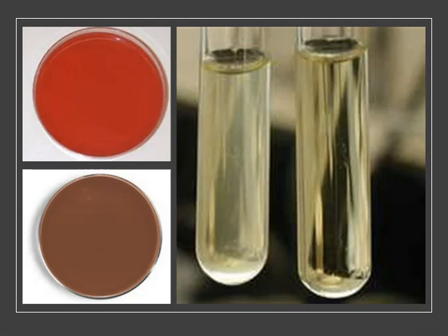Over here on the right-hand side of the slide, we can see two broth tubes. I put this in here to show you that broth tubes can be helpful for us when we're growing cells in the laboratory, because broth tubes begin as a very transparent type of media.